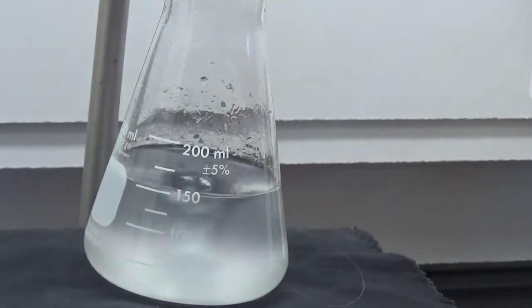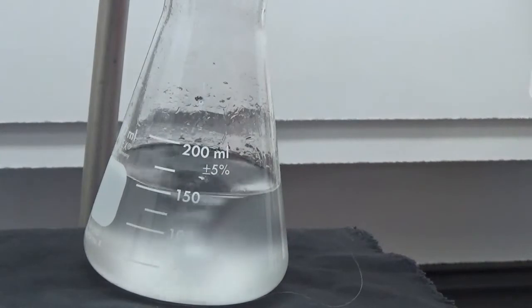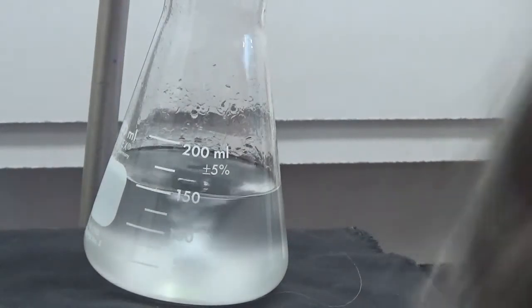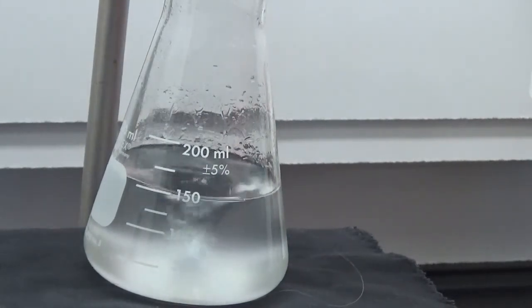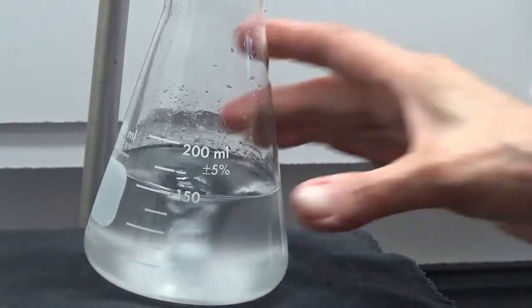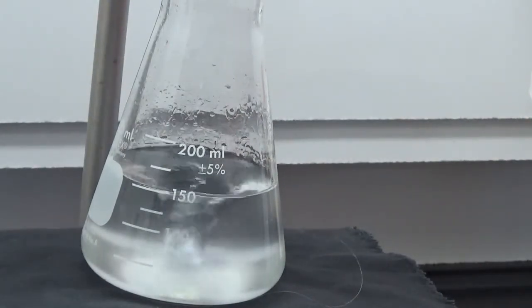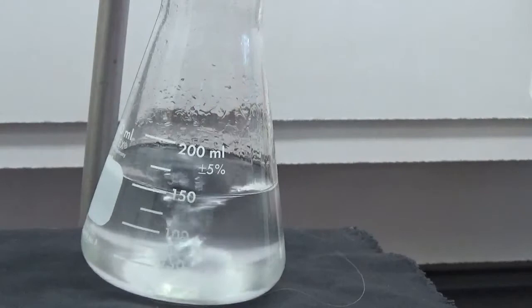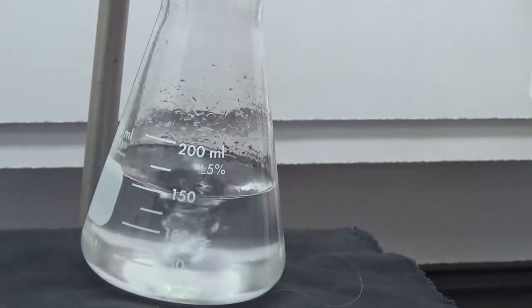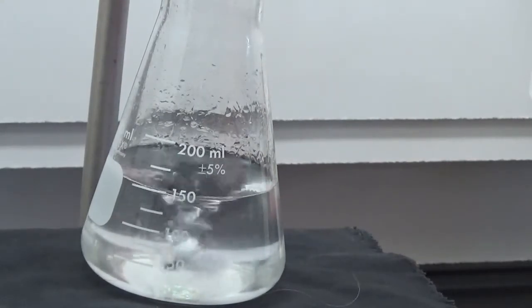Another 5 drops. Not quite. 2 more. Clear. Let's see. 15.12.